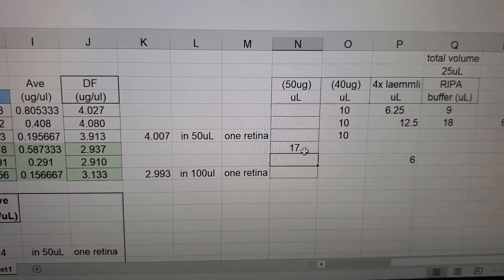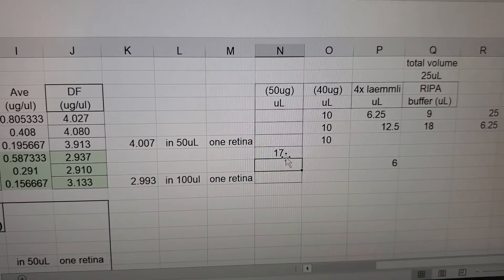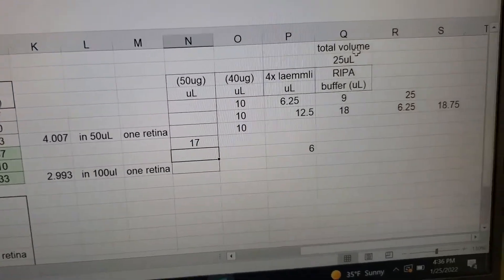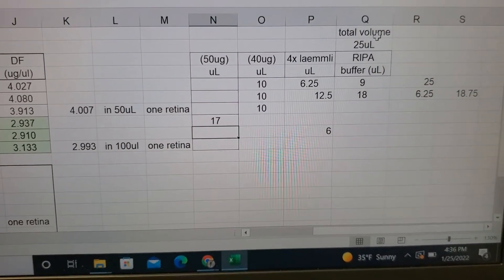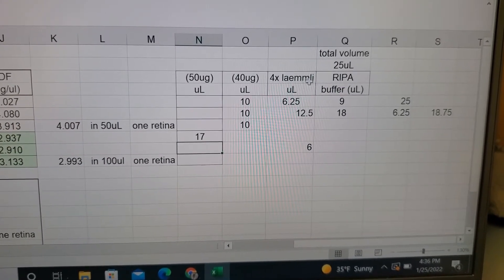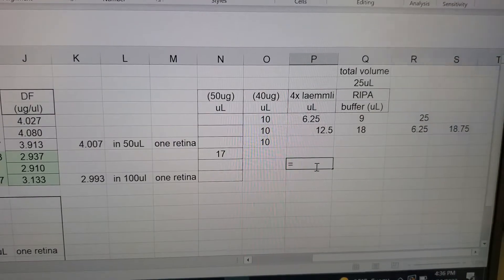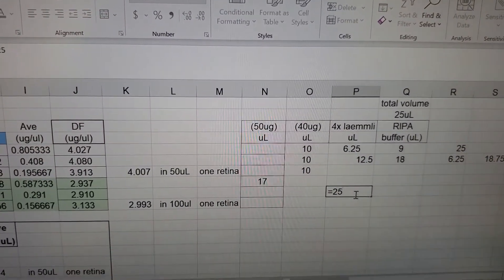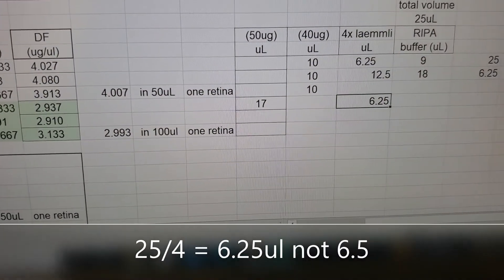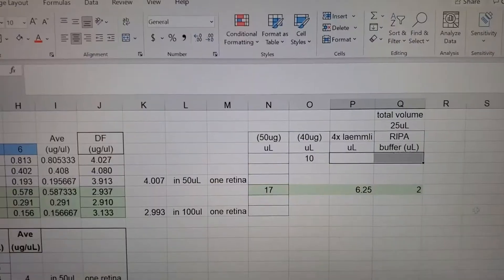Once I know the amount of cell lysate — in this case, tissue lysate — I need, I want to make sure that I have a total of 25 microliters to load. Remember that we're also using the 4X Laemmli and RIPA buffer: you use one-fourth of your total sample volume as 4X Laemmli. So I do equals 25 divided by 4, which gives me 6.25 microliters of 4X Laemmli.